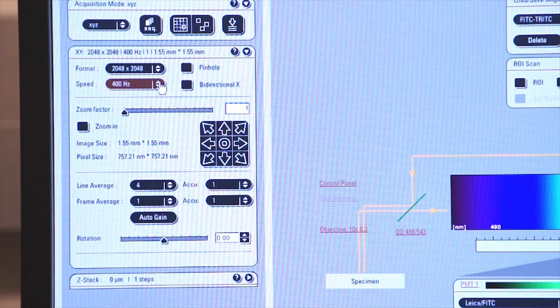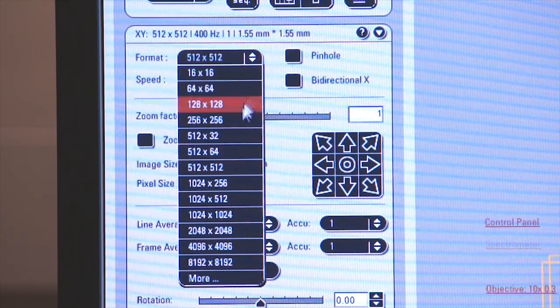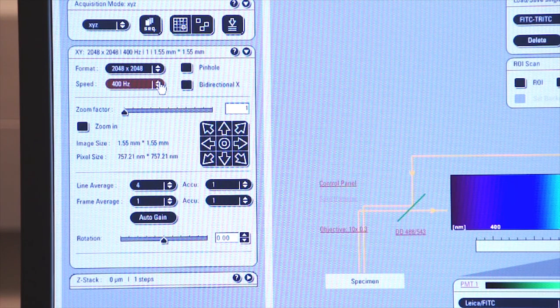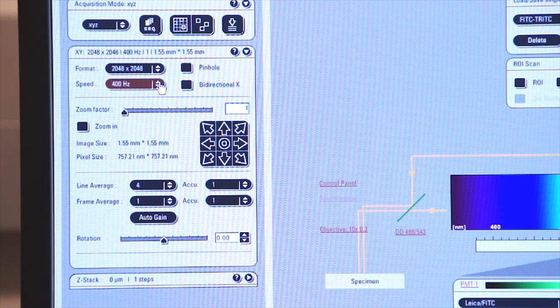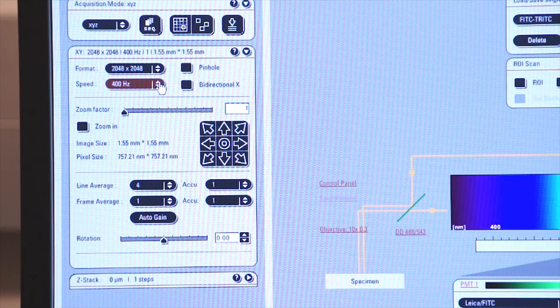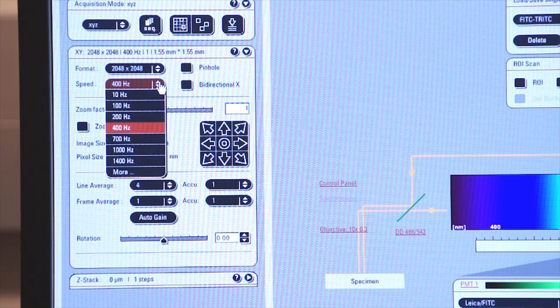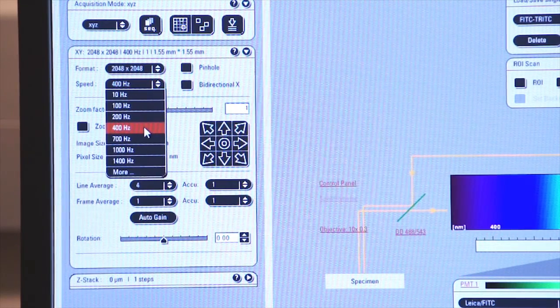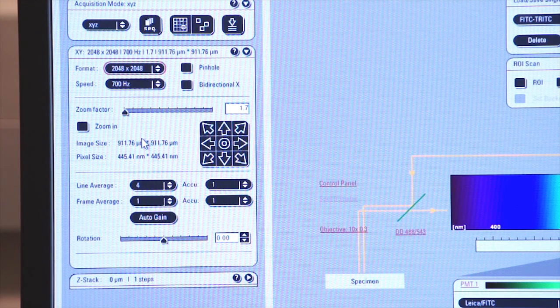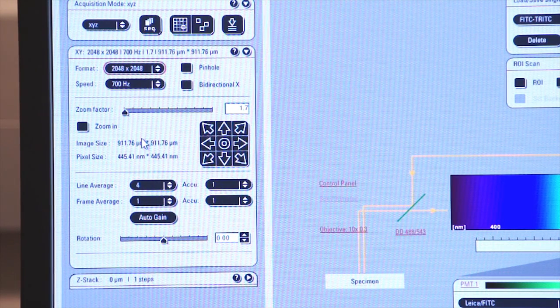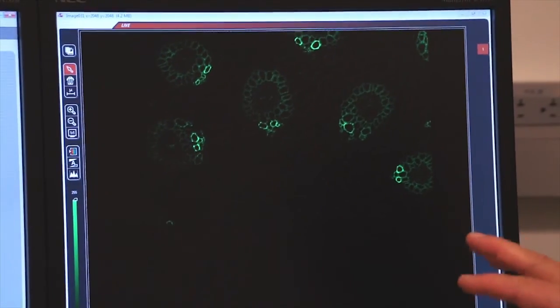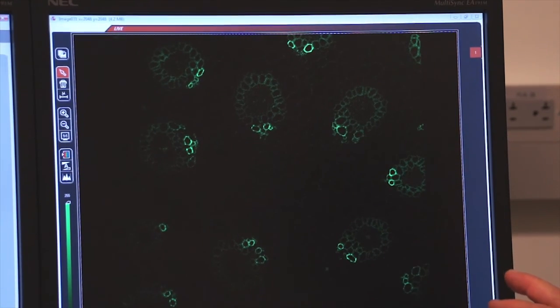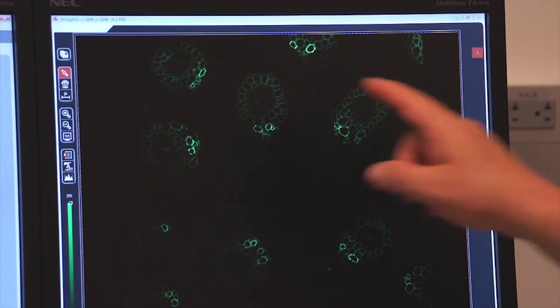You notice when we increase the resolution of the digitizer to 2K by 2K, the speed of our scan was slower. Particularly when we use line average to average out all the noise. In order to increase the speed of the capturing of the image, we can increase the speed of the processor. So we've been at 400Hz, let's go to 700Hz and we'll capture an image again, and we'll watch how the speed of the capture increases as a result of speeding up the digitizer. So it's a little bit faster than it was before. Remember we're doing 4 lines of average.